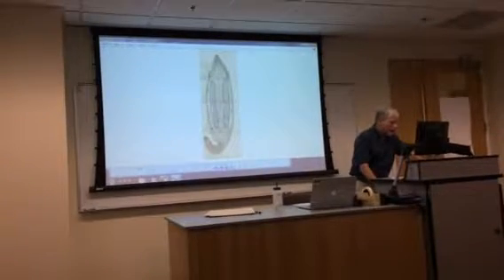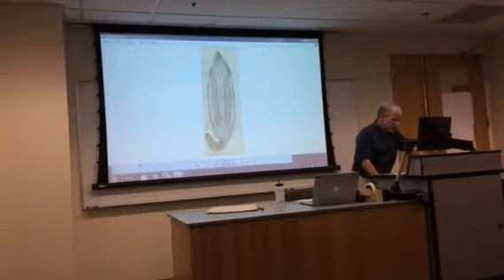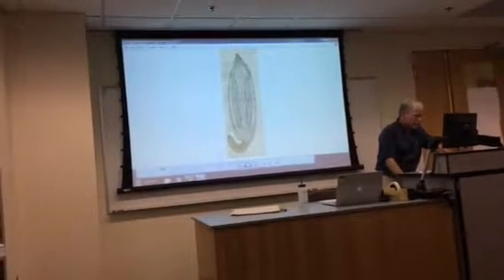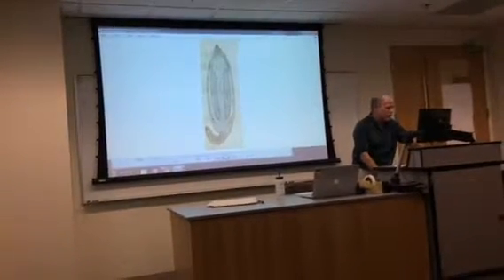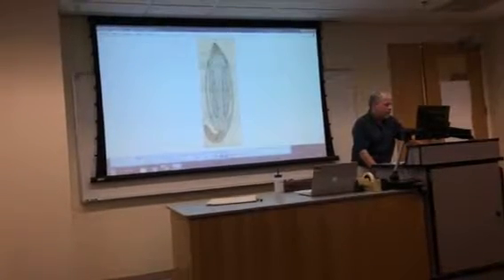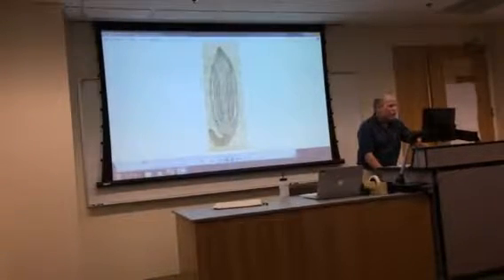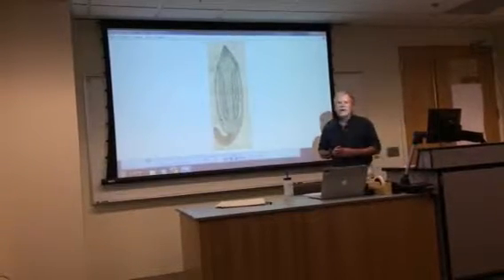Okay. Moss capsule. All right, so this is the true moss. You don't see the foot, but it's pointed. The seta is elongate. You have a columella in the middle. That's a sterile column of cells. That's the capsule of the sporophyte. And then up here is an operculum that pops off. So it's like a cap. It pops off. In this case, these guys do not have elaters.